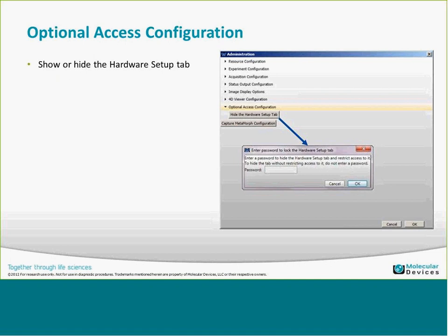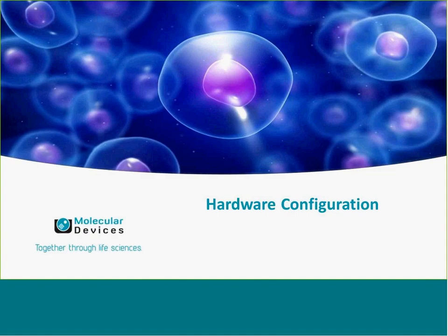The last option is the optional access configuration, which allows you to hide the hardware configuration active context tab. This is all-or-nothing — if you hide it, you won't be able to create new illumination or magnification settings. In a core facility that may be beneficial, but for everyday users it may not be desirable. When you hide it you can set a password, and you'll have to type that password to unhide it.